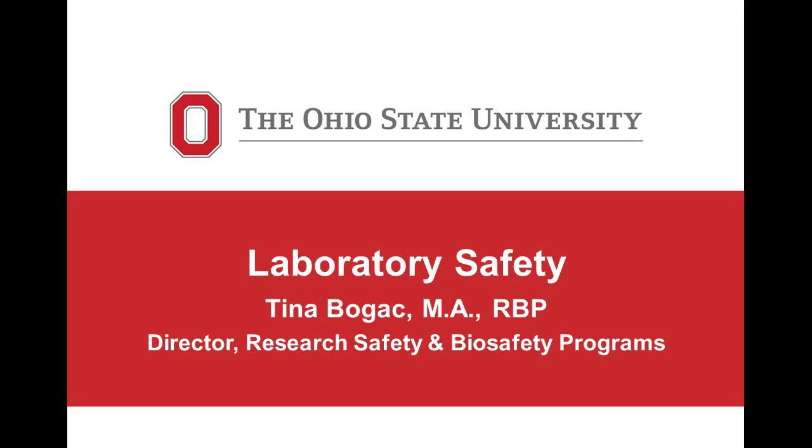The second one is the lab standard training. The lab standard training covers all of the chemical safety that you need to be aware of when you're working in the lab. I am not going to cover that stuff today. I don't want to be redundant. I don't want to tell you all the stuff that you're already going to learn online. It's boring enough as it is, so I don't want to go over it all again. But if you go through that and you have any questions about anything in the online programs, please don't hesitate to call me. I'll be happy to answer any questions.